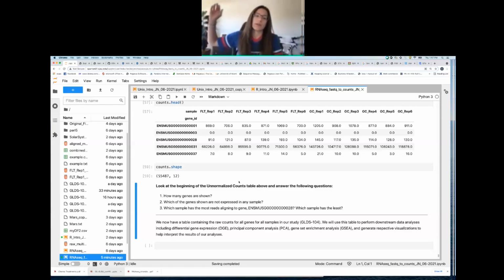And so when we do our annotations and map to certain gene names, then we can filter based on the gene names and get rid of duplicates. So I will confirm all this tonight and either confirm what I'm saying or correct what I'm saying tomorrow.